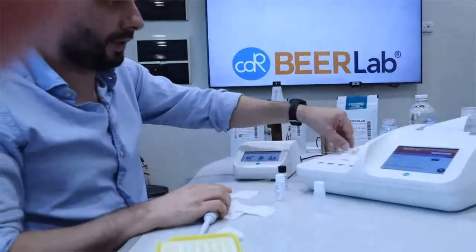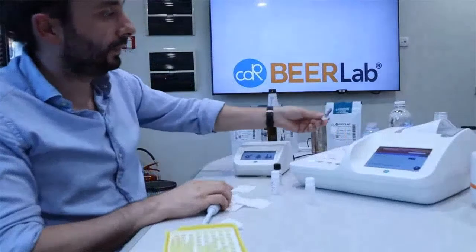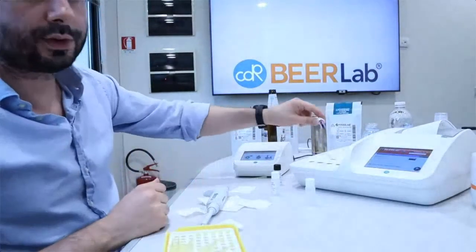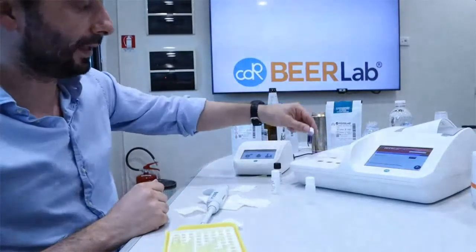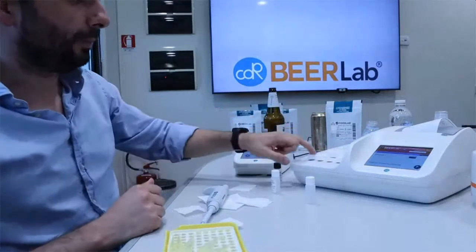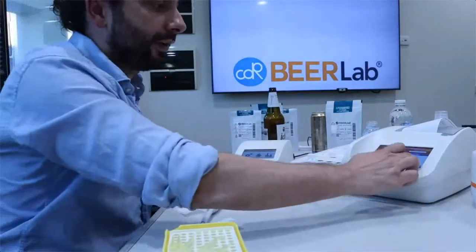Practically, what we have here is a change in color, and this change in color is correlated with the concentration of the calcium, of the magnesium. So we put the cuvette into the reading cell, and we read it.